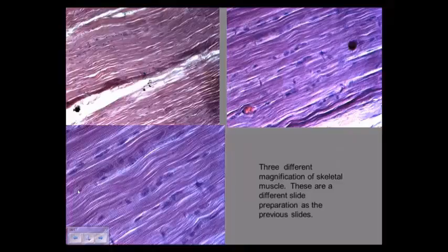What can I say? That's about it. Okay, more skeletal muscle. Now this right here, you may see something like this that looks like an intercalated disc, but it's not. It might be a smashed nucleus or lint or dust on the slide. Okay? But you can see the striations. That's it.